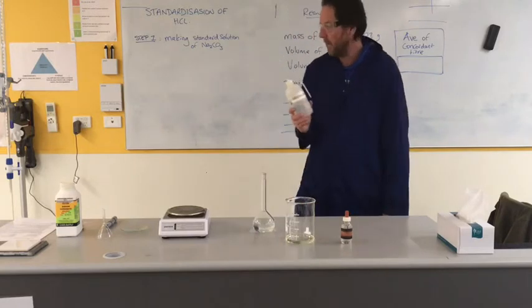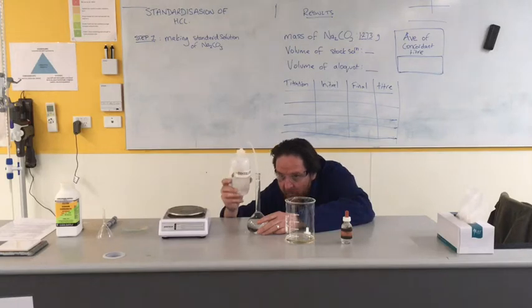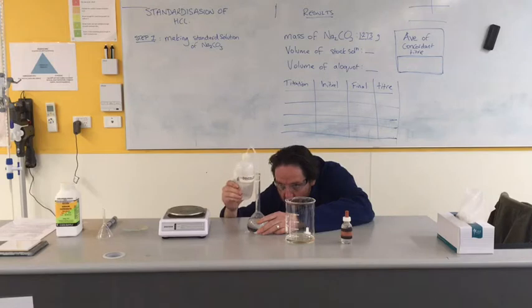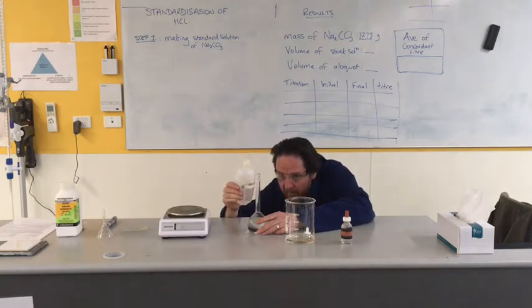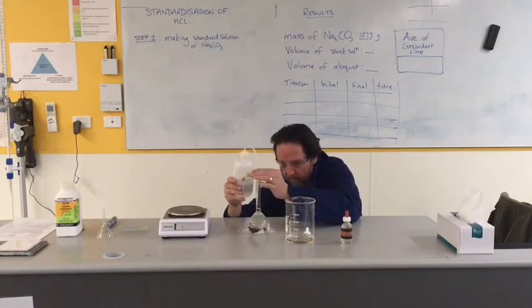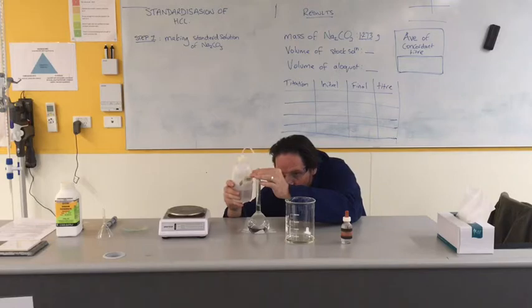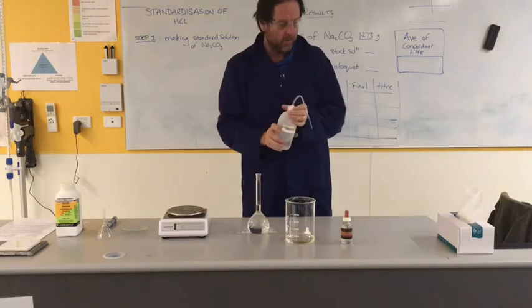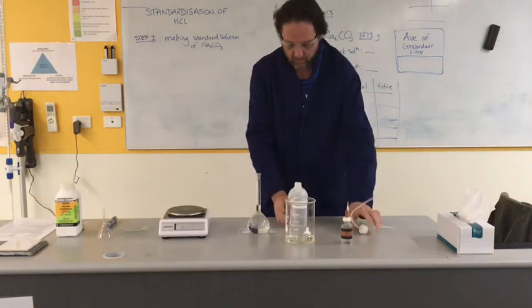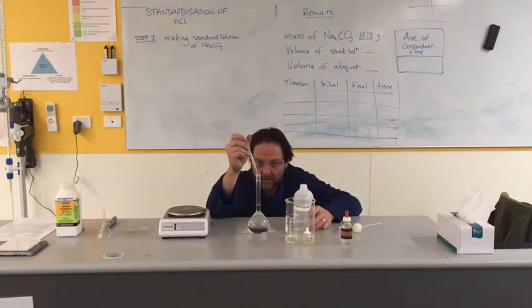Now I'm going to try my best to fill it up to the mark. Getting down low, I want the meniscus to be right on that level there - probably the most exciting thing for you to watch on the video. It's always worth being a little bit careful once we get over the fat bulb because it does go a lot quicker after that. Getting to the scary bit - I can go drop by drop. I'm getting much closer now. To ensure I don't go over, which would be an absolute disaster, I'm going to use a little disposable pipette for more accuracy and control.